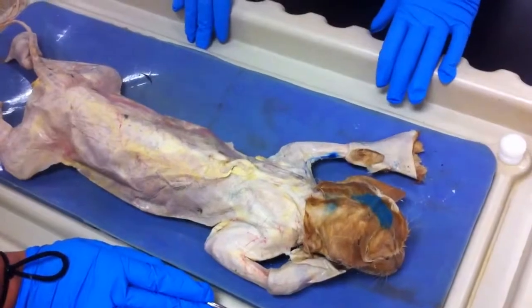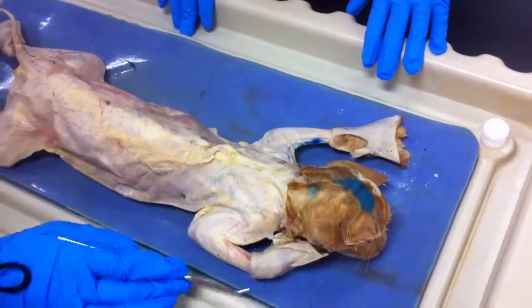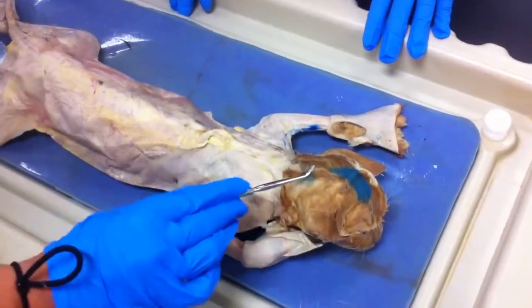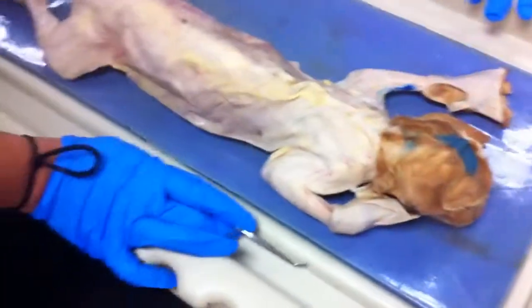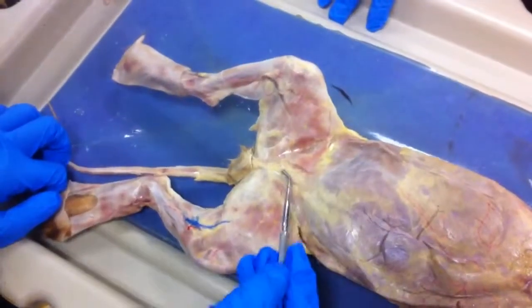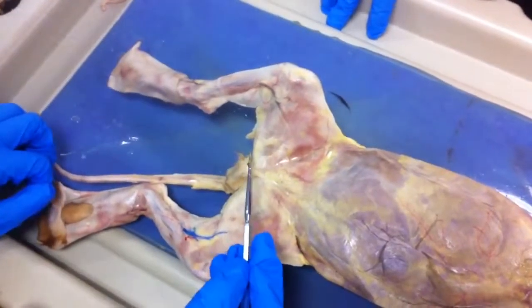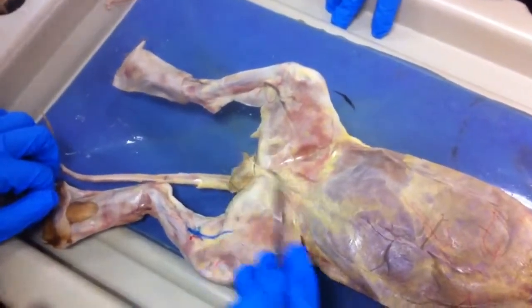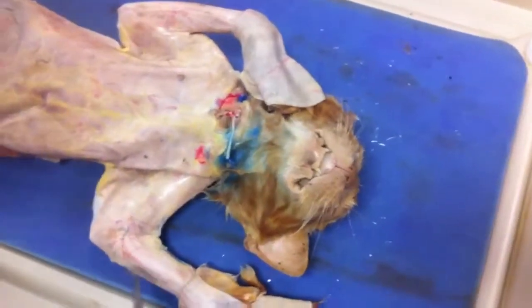What we are dissecting is a cat. The phylum is Chordata and the subphylum is Vertebrata. This is fur, which helps it keep warm. Alright, the specimen we have is a male, and this is the external reproductive system, and this is the testes and the penis.